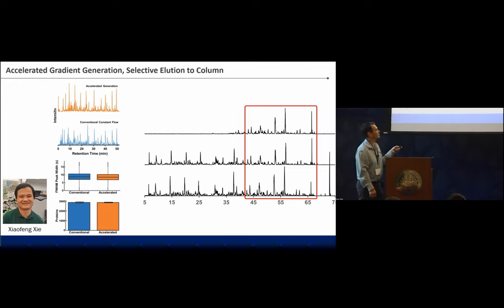Great progress. Nice talk. Thank you. Always happy to see your progress. And to follow up on the technical side of things, you mentioned your SPE column, one or two on your schematics. I think it was just one. And I know you're interested in developing new types of SPE columns. Is there anything new, specific, special about that SPE column that you used? A packed column or monolithic column, anything like that?